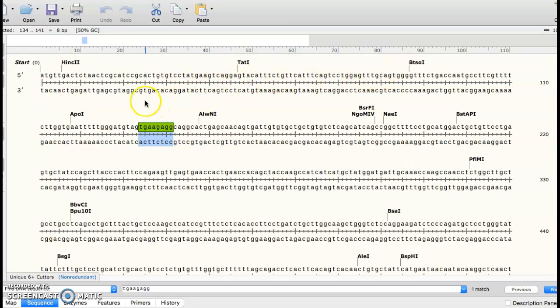So I'm going to probably start designing somewhere in this region for my forward primer, and then the reverse primer just needs to be bracketed and downstream somewhere over here. If I start grabbing nucleotides and dragging, you can see there's a melting temperature there in purple, right? So I'm going to grab somewhere around 20 bases until I'm around 60 degrees.